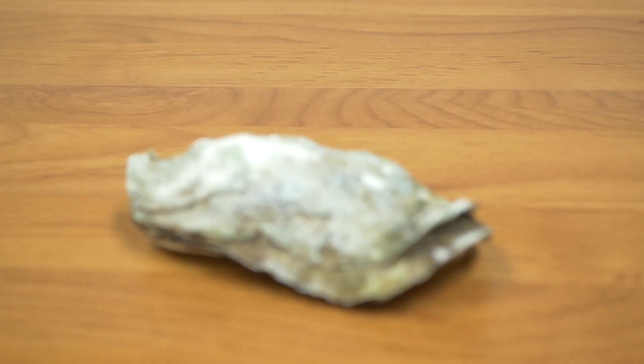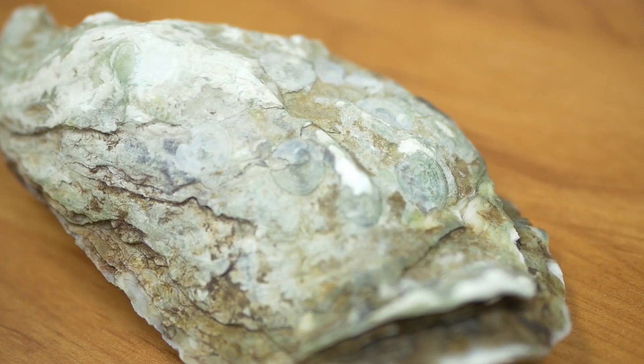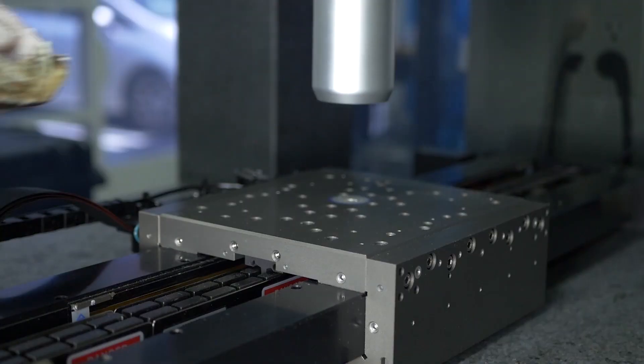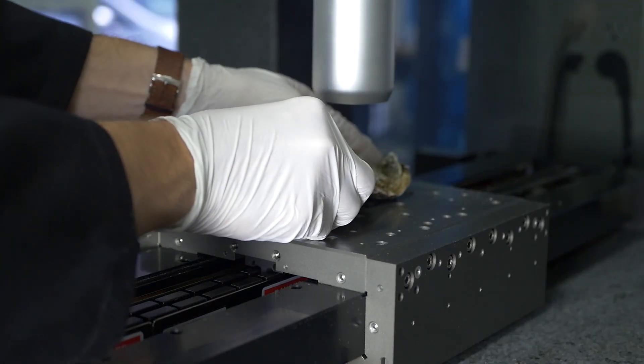The capability of the Ninovia HS2000 line sensor will be demonstrated today by measuring the surface of an oyster shell to demonstrate its ability to measure a sample with abnormal geometry. Typically, samples need to be fixtured to a stage to mitigate their displacement, but with the Ninovia HS2000, little to no sample preparation is needed to begin your testing.